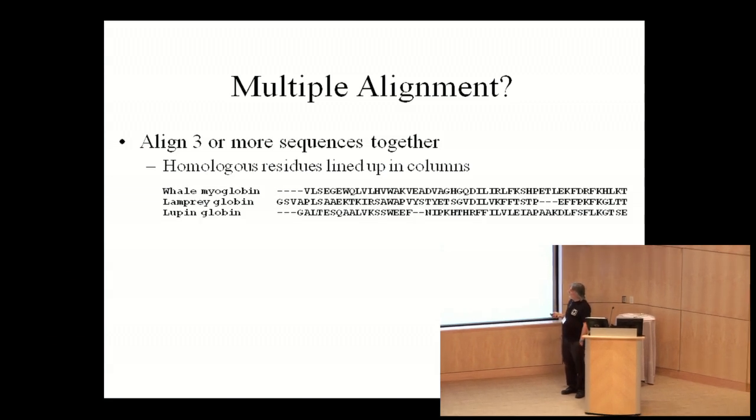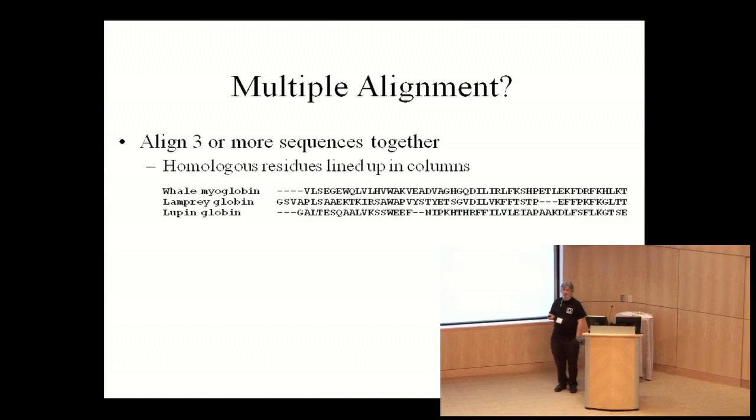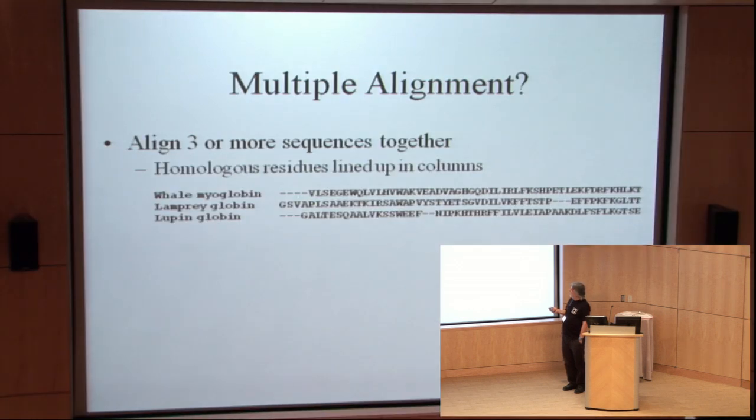It arises due to the fact that amino acid sequences evolve, they diverge. When sequences diverge, they accumulate differences, they lose bits or they gain bits, and because of this, it ends up as a computational problem: how to line them up such that the homologous residues are lined up together in columns. And you might guess, if this is a correct alignment, that the ancestral sequence of all three of these had a W at this position in this alignment. It may not have done so.